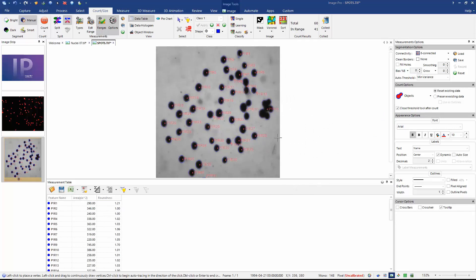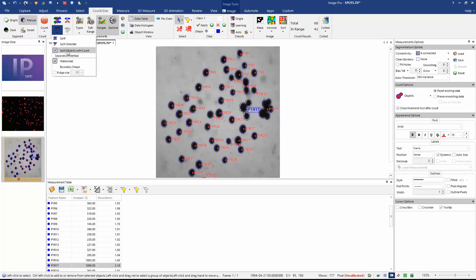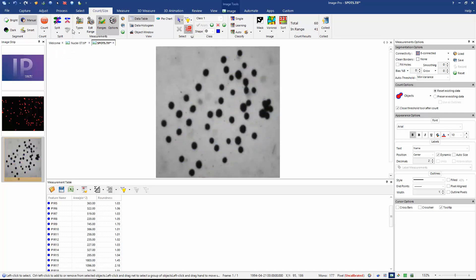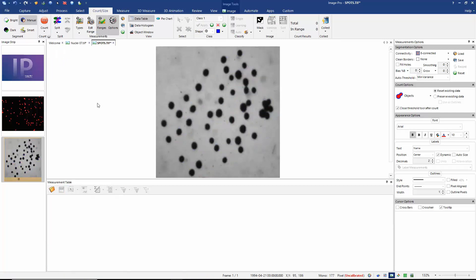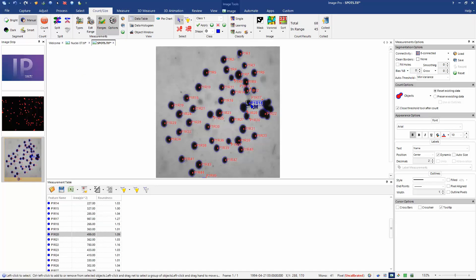Again, some of my segmented objects are joined together. So if we look, for example, this object, we can see we have three objects joined. So let's choose the option to split with count. And if we recount our objects, we now have objects that are quite nicely separated.